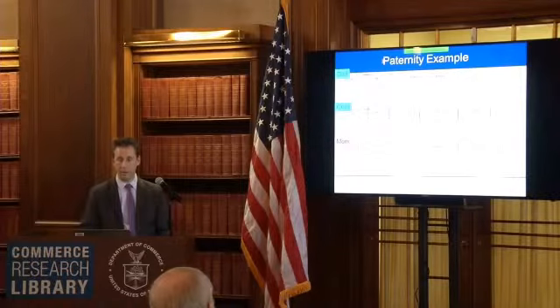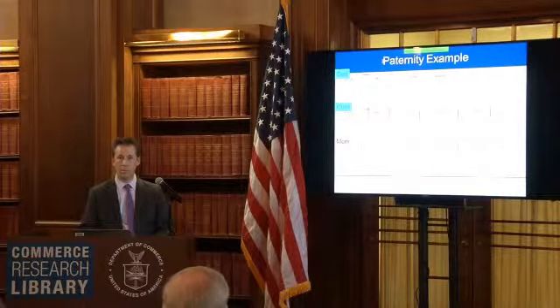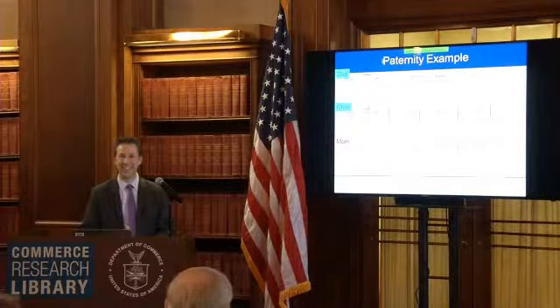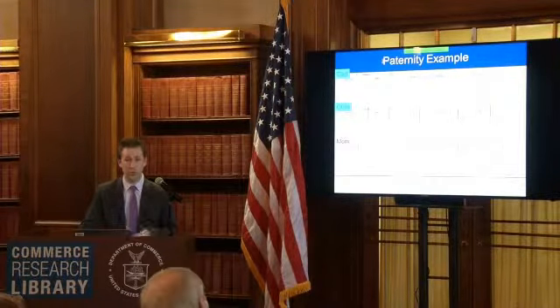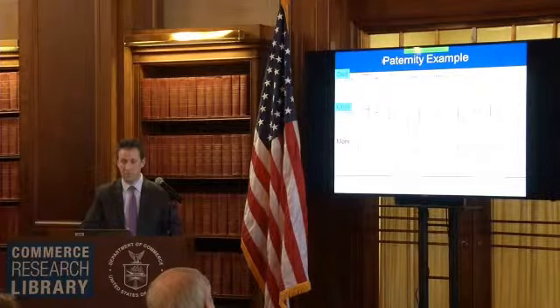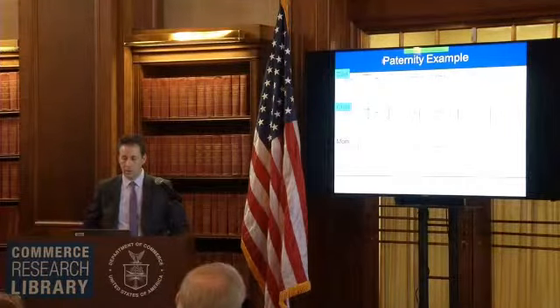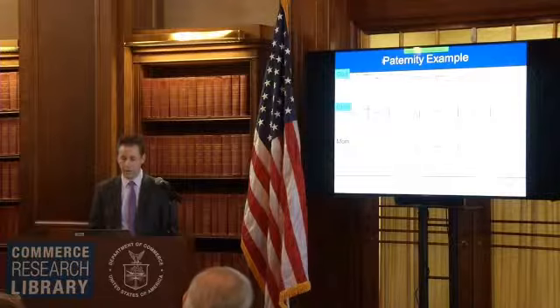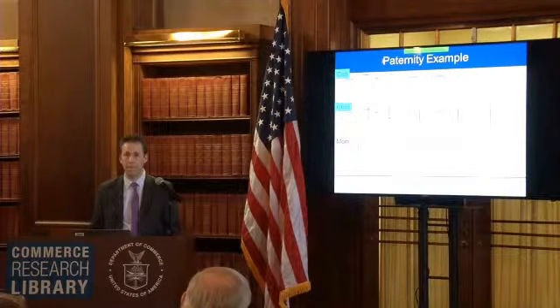Right. How come? Because the child has a 7, and he had to get the 7 from somewhere, and the 7 came from the mother. But how come the 6 didn't come from the mom? Because she gave him the 7. There probably is maybe a 1 in 1,000 chance that her 6 could have mutated to a 7, and that could potentially be the source of that. Each parent can only give one, so the child has to get a 7 from somewhere. Yeah, the dad would have to have a mutation for one of his 6s to turn into a 7 for that to be the case.